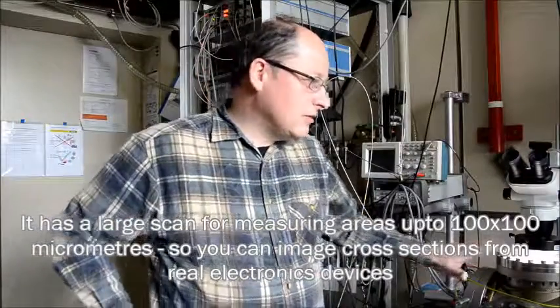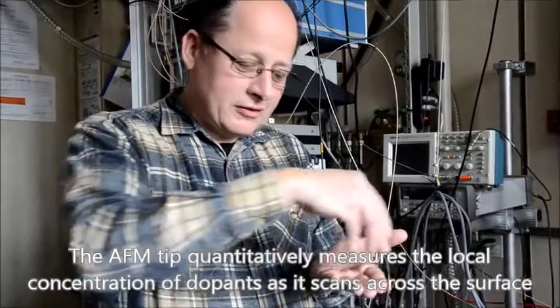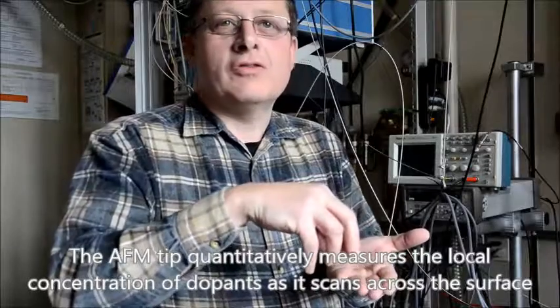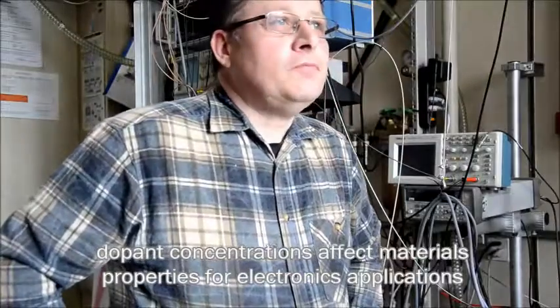And the interesting thing is we measure here with the AFM tip the local concentration of dopants. So basically the tip scans across the surface of this cross section, and then you have areas where we have increased dopant concentration, and what we are interested in is really to measure these concentrations. And in that sense, it's also a bit in the direction that the AFM is not just a tool to measure topography, but it's something where we can basically also measure electrostatic forces.